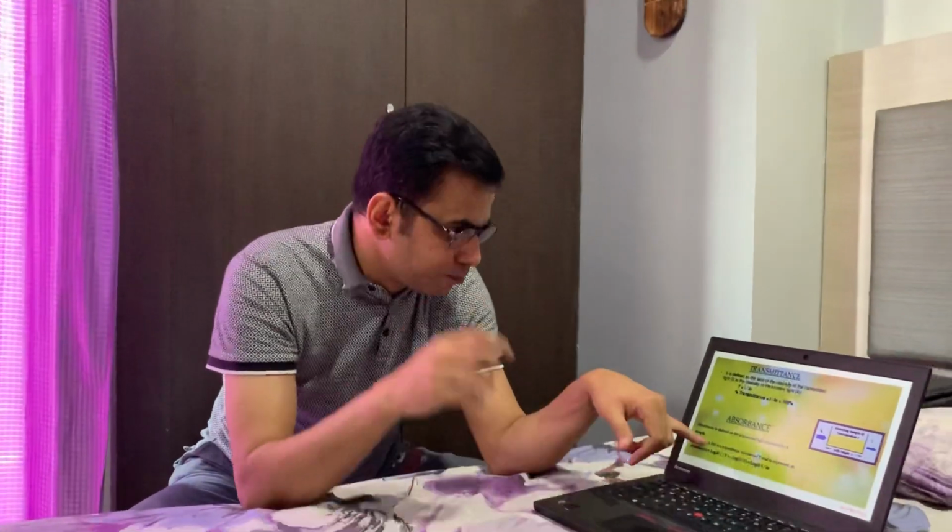If I summarize here, you can see this is the I naught, this is the I, and this is the path length. The transmittance is simply the ratio of the intensity of the transmitted light to the intensity of the incident light, and you can easily calculate it. And the absorbance is simply defined as the amount of light absorbed by the sample. Again, you can calculate it, as I told you before, in the logarithmic function: A is equal to log 10 of I naught by I.